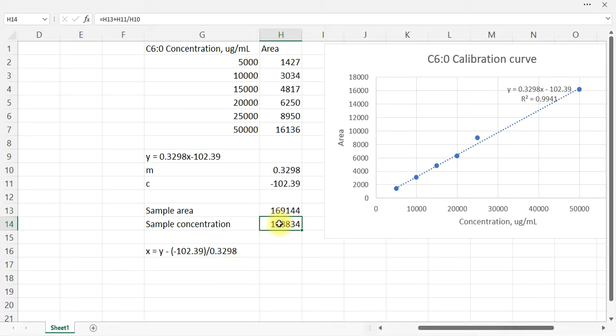Or is it upside down, placed there? The bracket here. This one. If that, it adds, right. Is it this one? Correct. It should be this one like this. Okay. So you will get the concentration of this one. The unit is ug per mL.